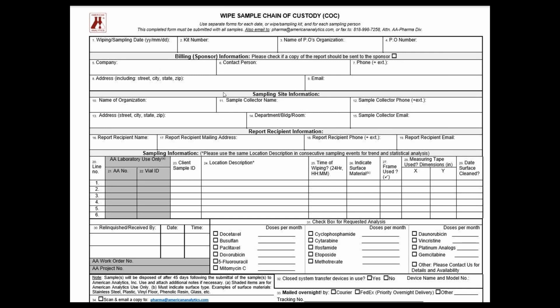So whoever's paying for this wipe sample event, the company name, the contact person, their phone number, their address, and email all need to go in this section here.